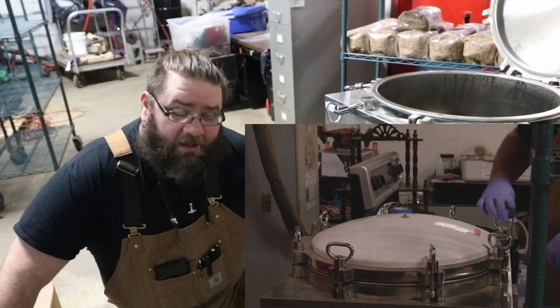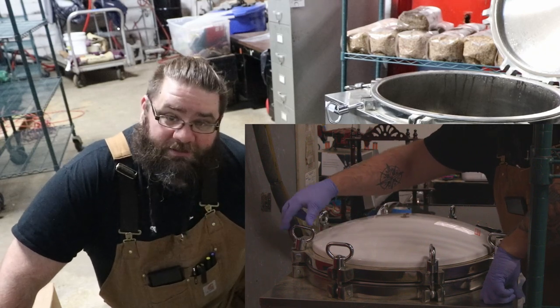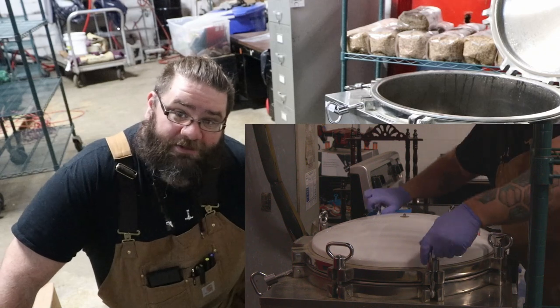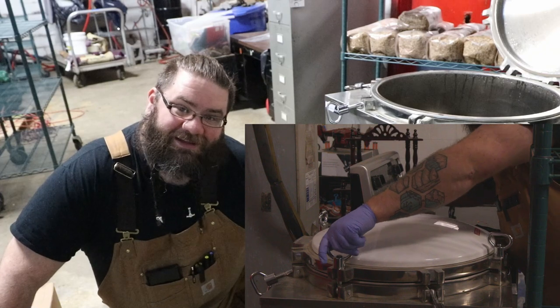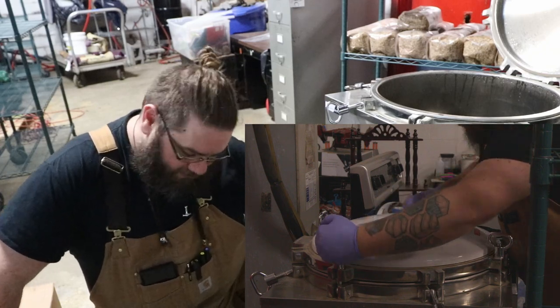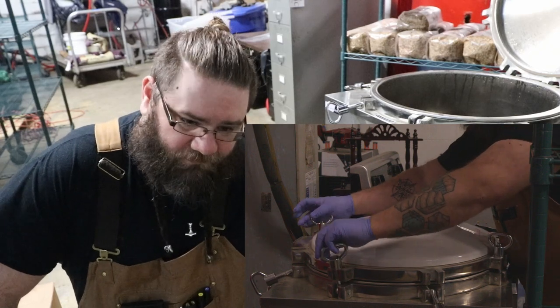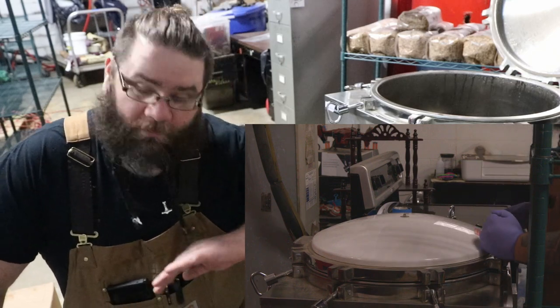Anyways, back to autoclaves. When it comes to these autoclaves, I freaking love this thing. I do my liquid culture in it. You're not supposed to do glass in it, so what I do instead is I place my jars inside of unicorn bags. I use the XLS-AE bags, which are the 0.5 micron. I don't even close them, I just fold them over.